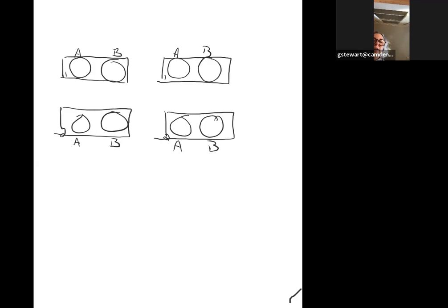So my set number 1 here, I put E. coli in that A circle for my smear. And then in my second one, I also put E. coli here like this. In my B, I put Staphylococcus epidermidis. And then I also put Staph epi over here. I put Serratia here in letter B, I believe. No, sorry, Serratia in A and A on these sets. So this was Serratia and this was Serratia. Serratia marcescens, so SM, capital S, lowercase m. And then for Micrococcus luteus, I put Micrococcus luteus here, capital M, little l, and here.